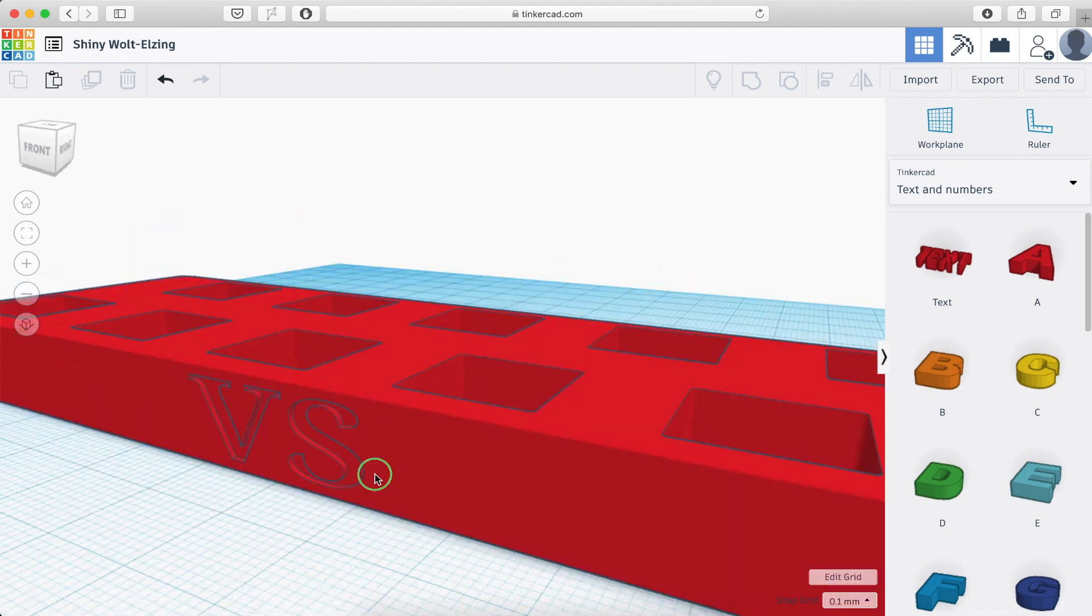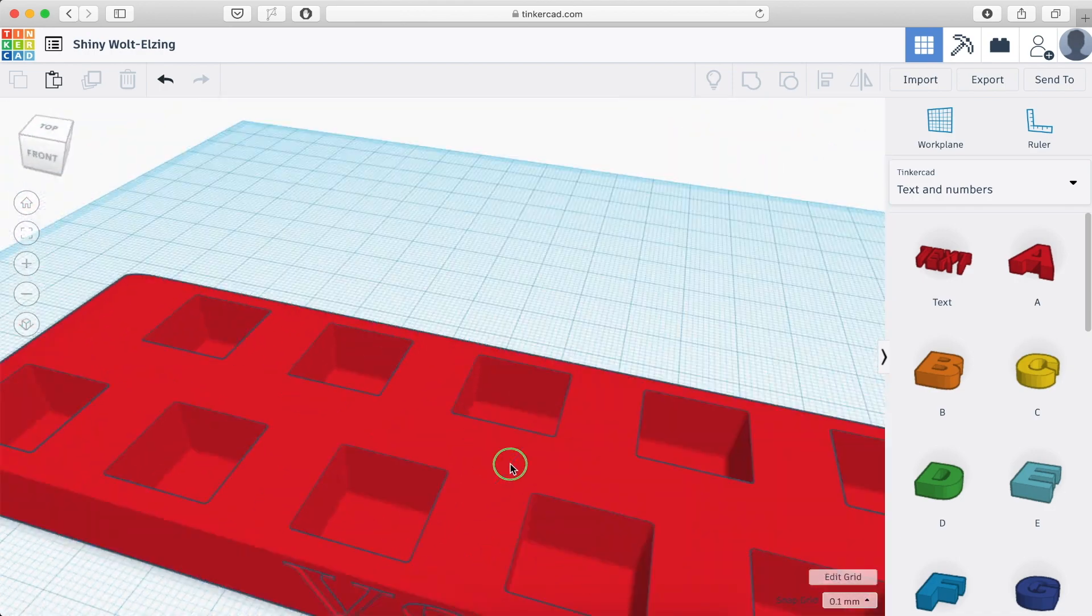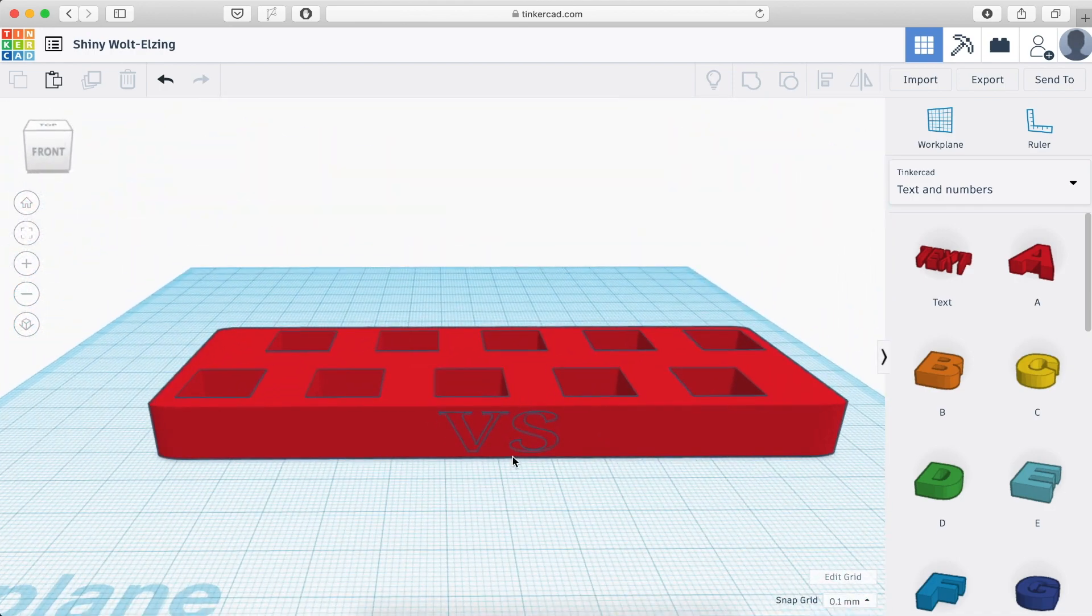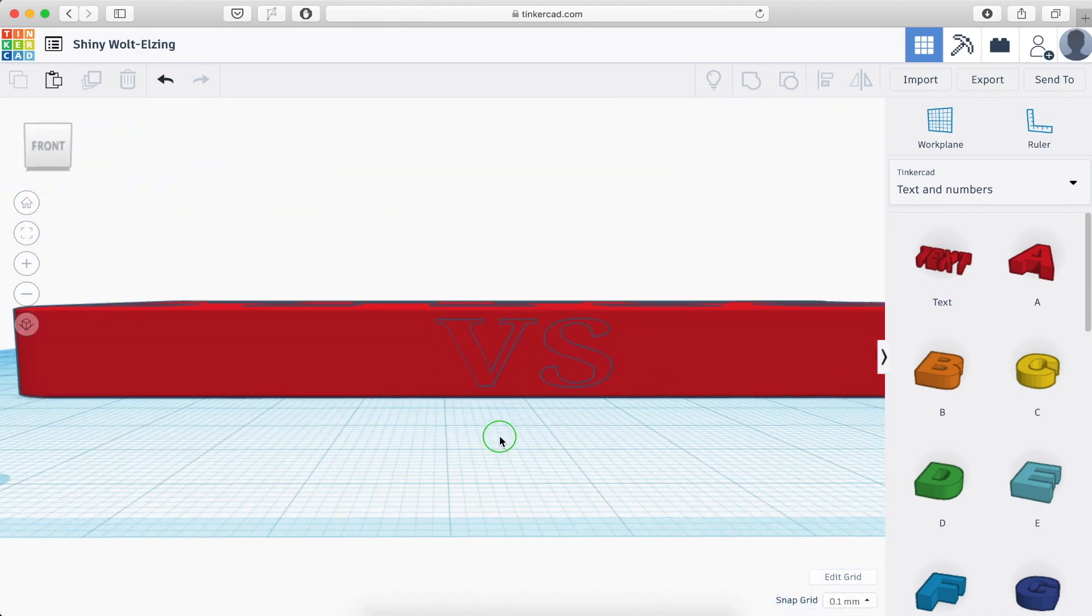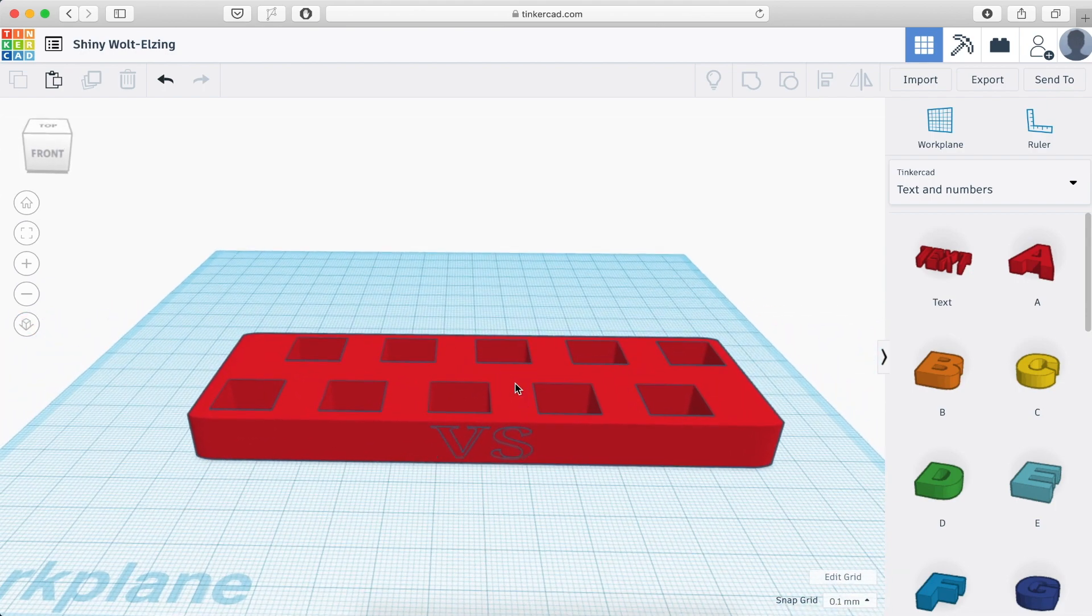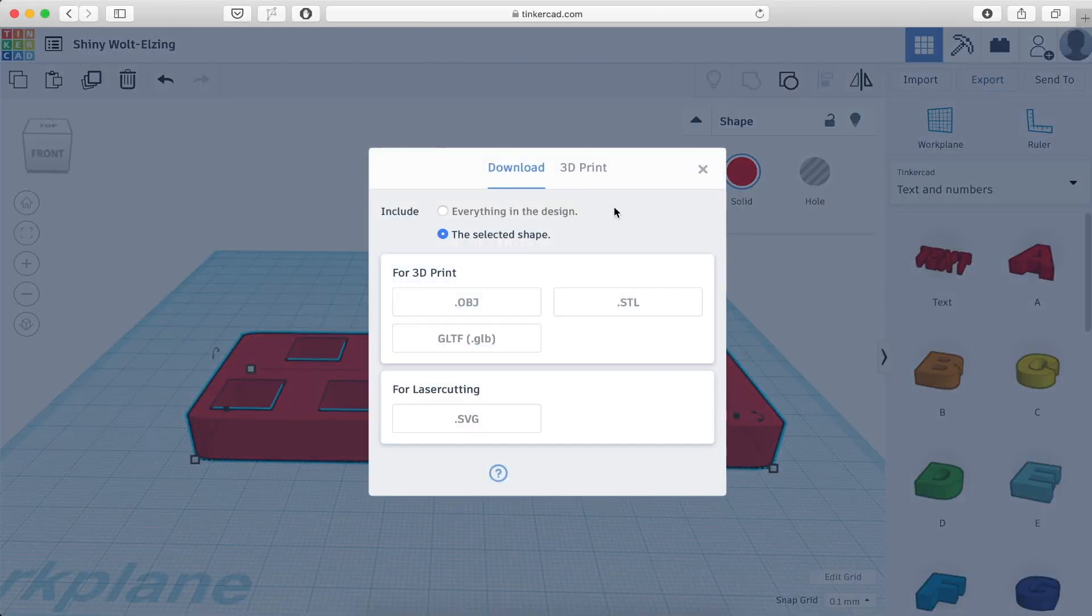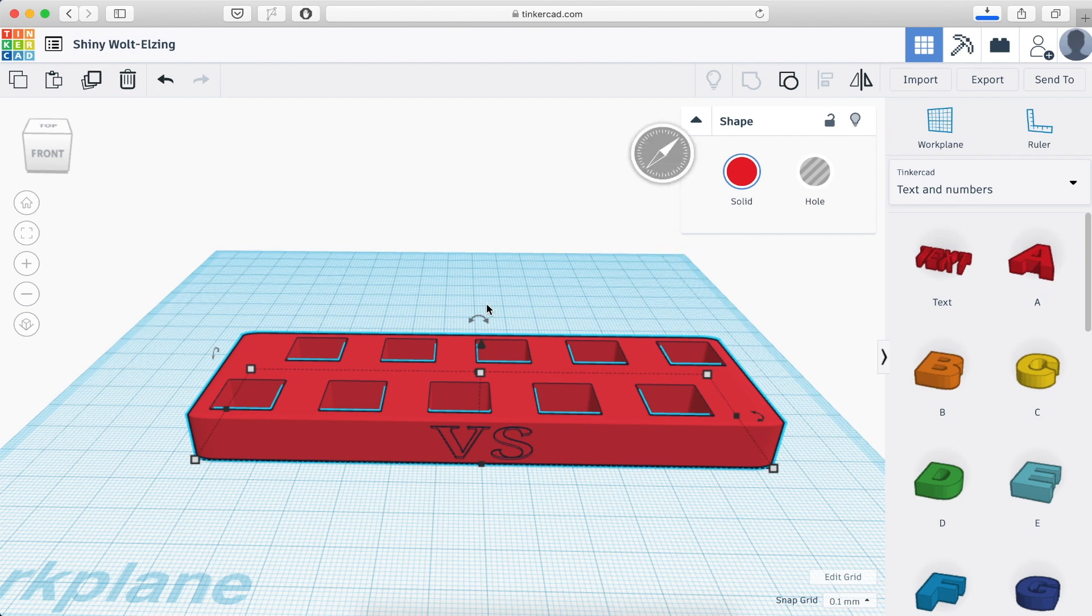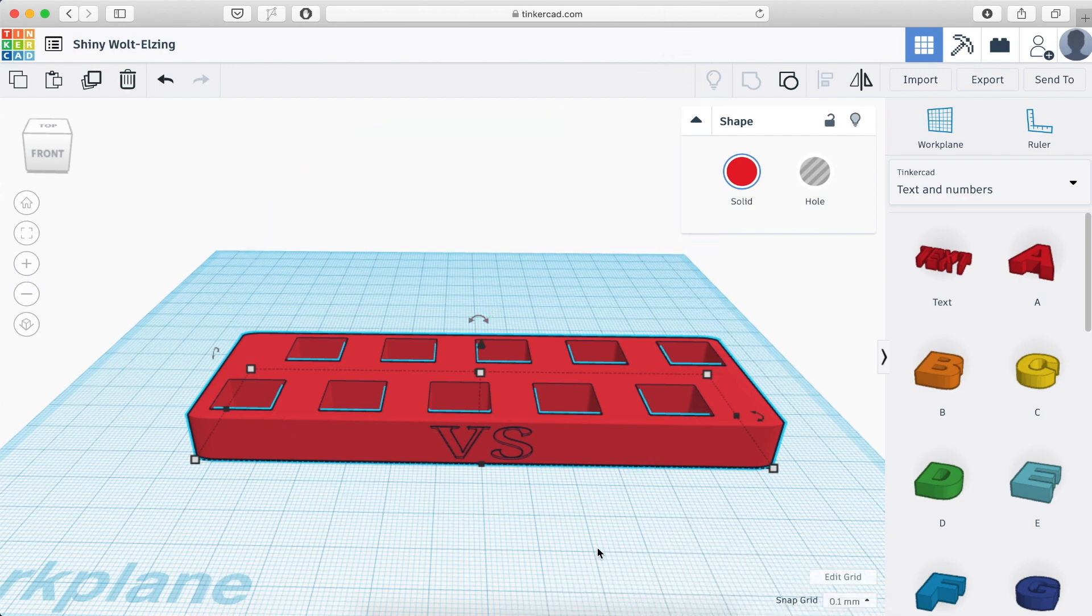And this is how it looks like, which I will say is perfect. Well, perfect, it's good enough. So I click on this one, I export, and I export this as STL. Save. Now let's go to Cura and slice it there.